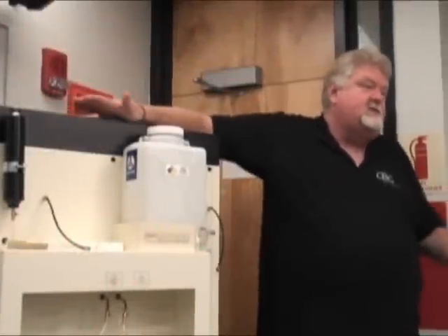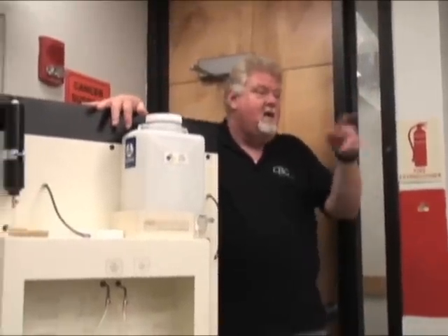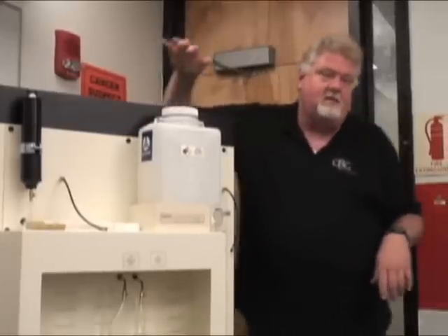Hi everybody, my name is Jeff Welch. I work for CBG Biotech. I've actually had lab experience before, so any questions about laboratory I'll be glad to answer. I worked in Pathology for about 22 years.